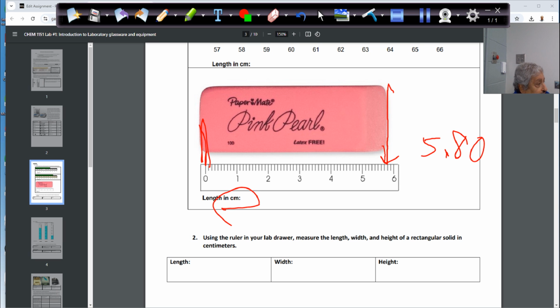So this is the first procedure, and then you can take the snapshot. I'm not taking the snapshot. We know how to do it, correct? Take the snapshot. Snipping tool is there in Windows. Snip all those 3 items we did in a blank Microsoft Office document. Snip them out. So we have the results of all those 3. So snip the results out. You can do it one at a time if you want. So it will be easier.